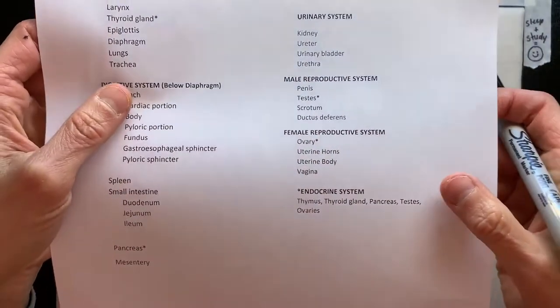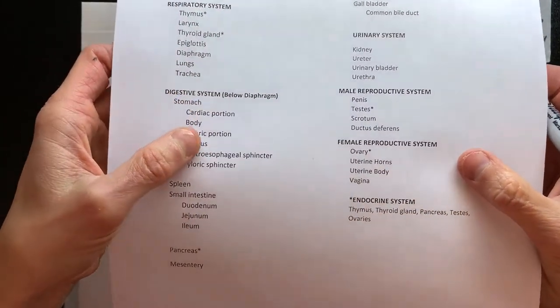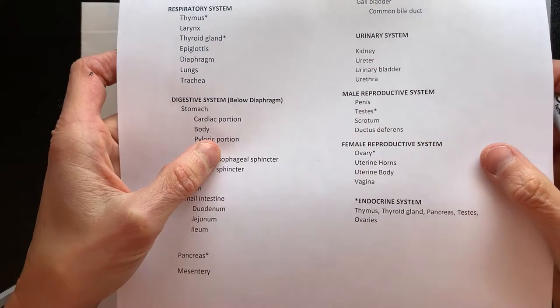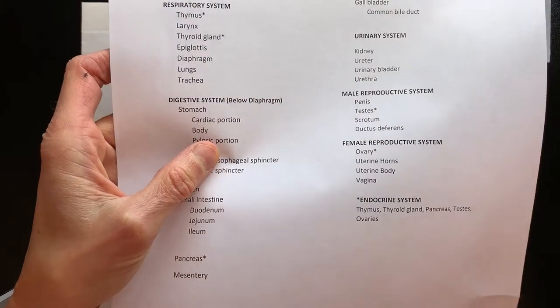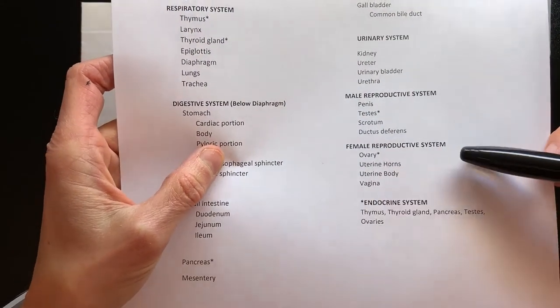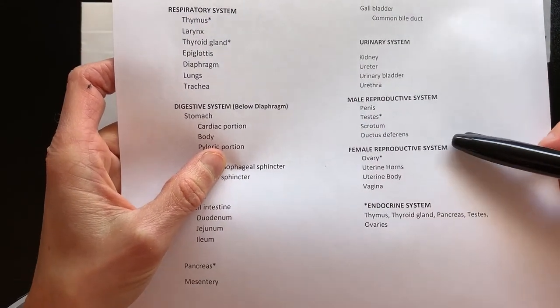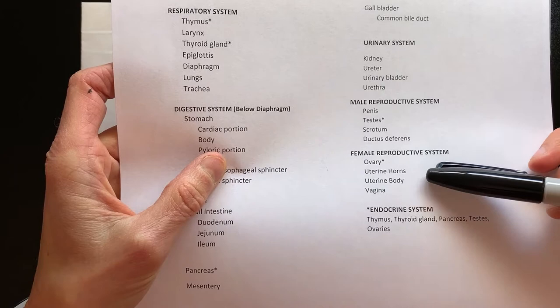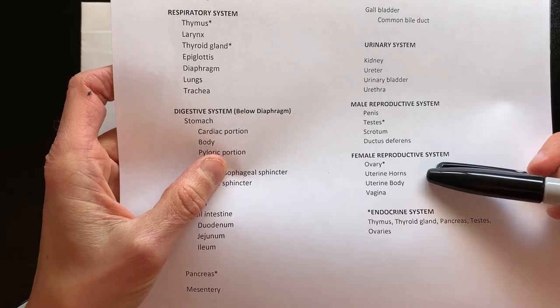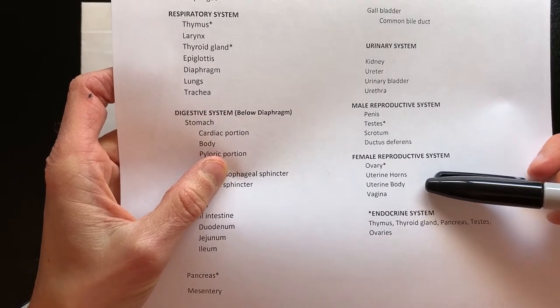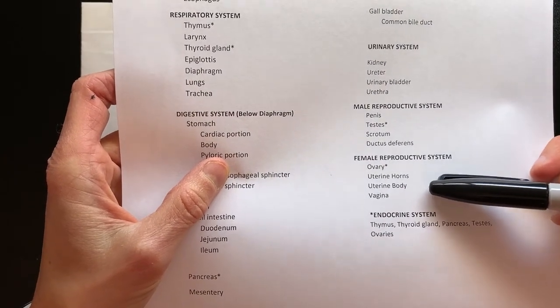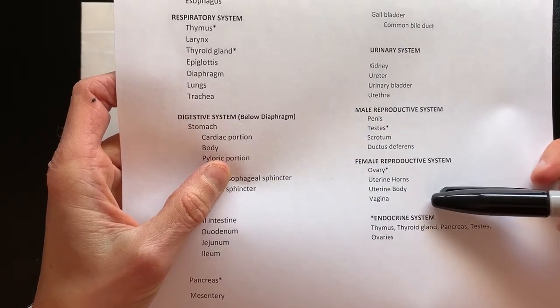Now we're going to look at the reproductive system. First we'll look at the female reproductive system. The female reproductive system includes the ovary, the uterine horns, the uterine body, and the vagina.